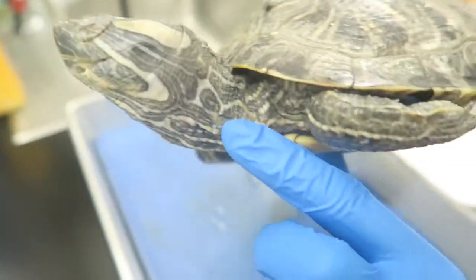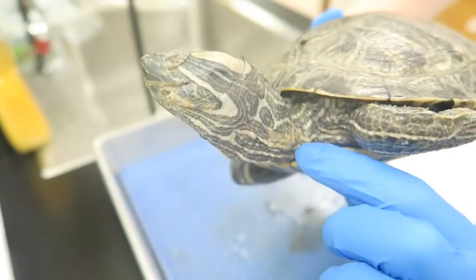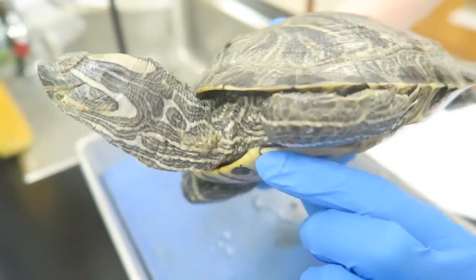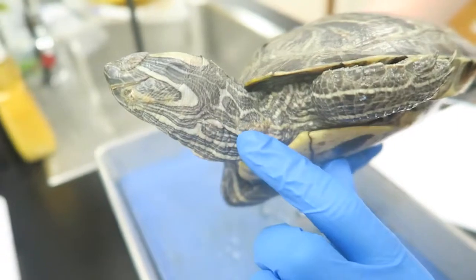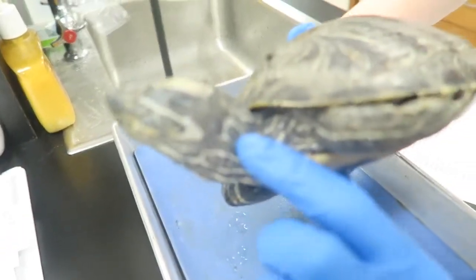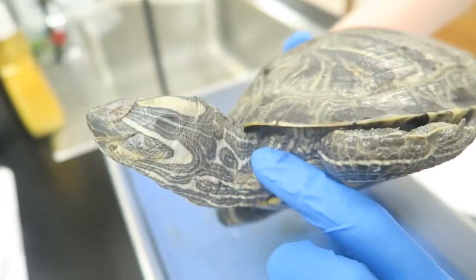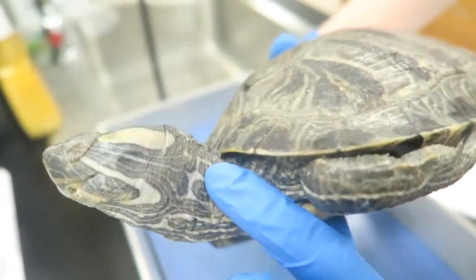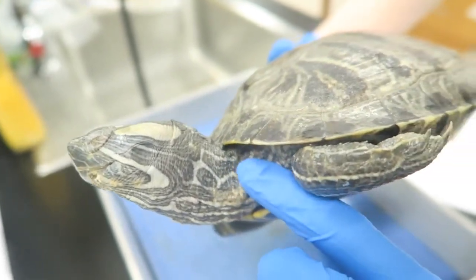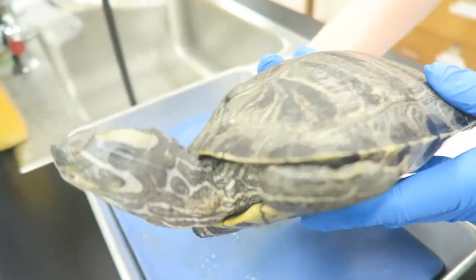Moving down, you see the turtle's neck, which is shaped like an S in these painted turtles. This shape allows it to pull its head into its shell to escape predators. You can see the neck covered in scaly skin, and the skin makes up the outer layer of the body wall, which protects the organs inside. The skin is the main organ in the integumentary system — it's very tough and provides protection, and also aids in osmoregulation because it keeps water inside the body.